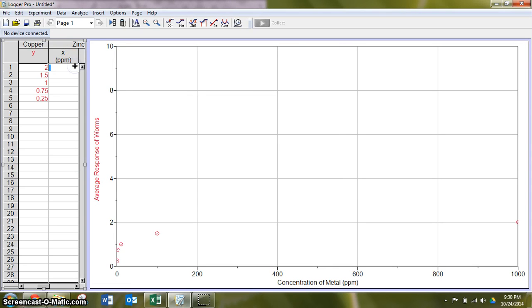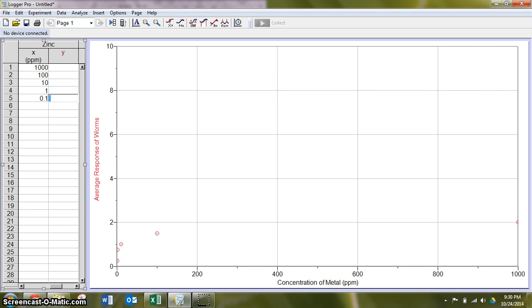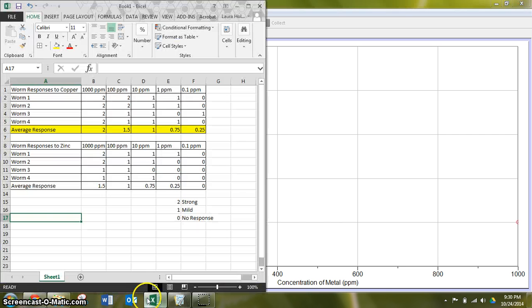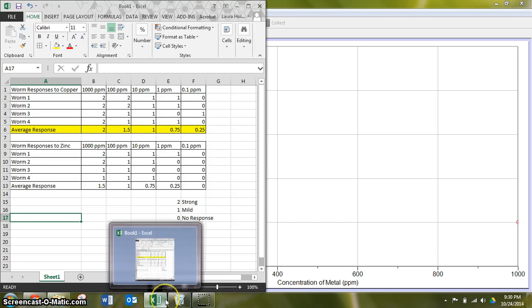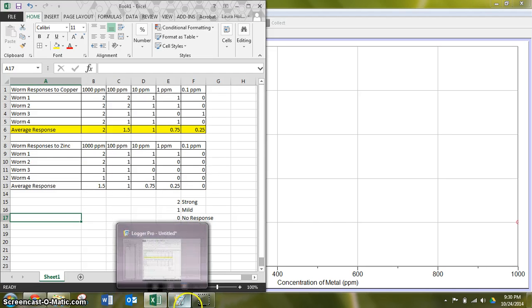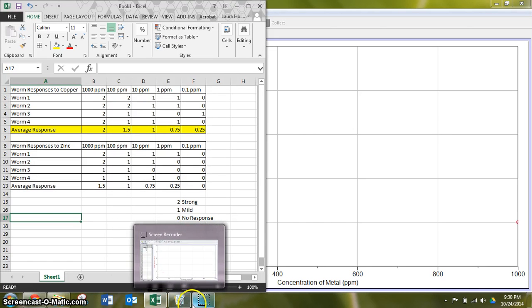Got to put in our concentrations again. And to double check, 1.5, 1, 0.75, 0.25, and 0.